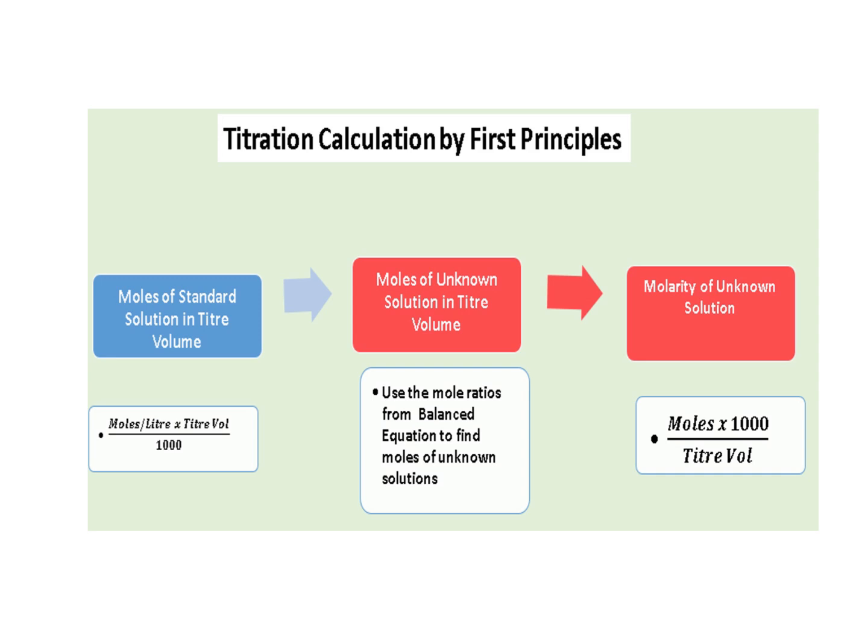Now, as you can see down below, I've created a flow chart for you which goes through the steps of first principles, and these steps are very clearly laid out. As you can see above it, it tells you in the boxes, the coloured boxes, blue and red, what each step is used to find. And below in the white boxes, it tells you how to complete each step.